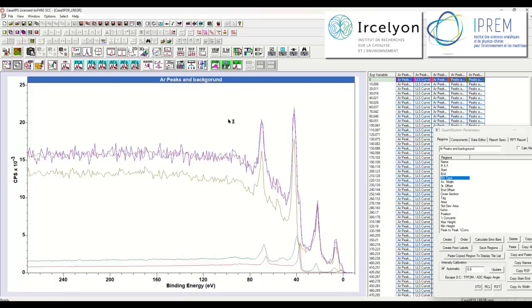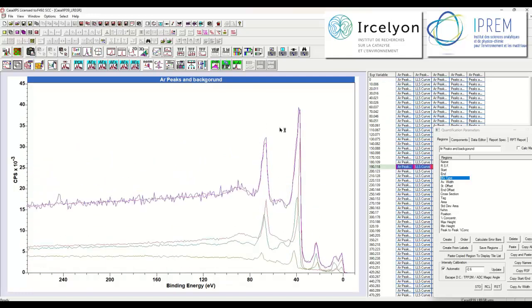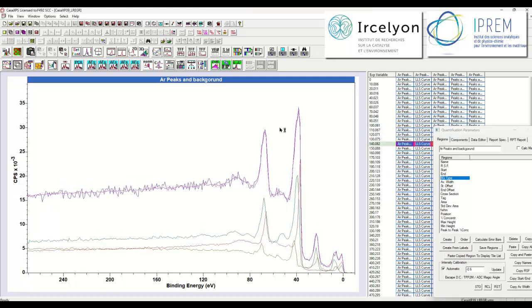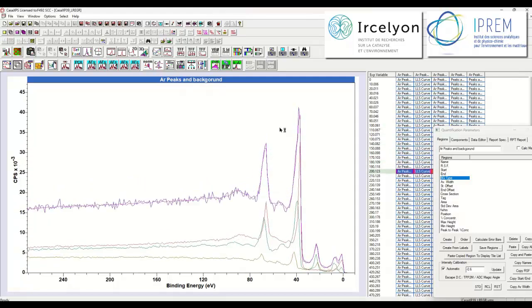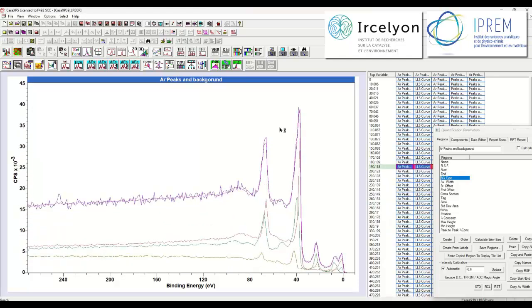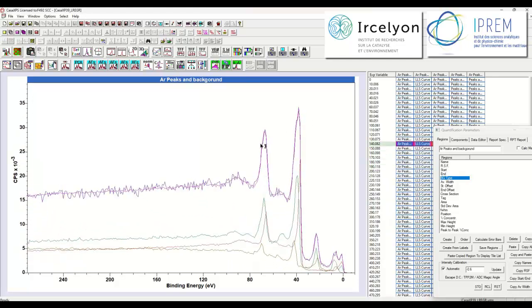And we again, despite having two spectra that are mostly calculated from the helium, we're getting the same sort of result. We're getting a good fit across the background and the photoemission peaks, and as we go through you can see that it is accommodating the fact that in the case of argon we are removing enough material to see an increase in the metal signal, while the rest of the shape is being represented by these two shapes that were calculated from the helium. So there's a consistency in the measurement.